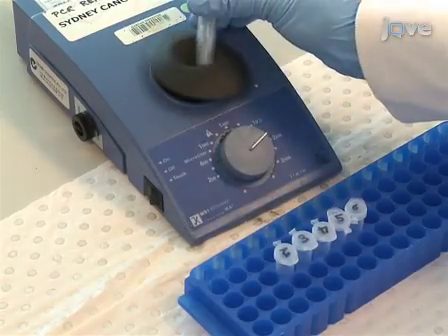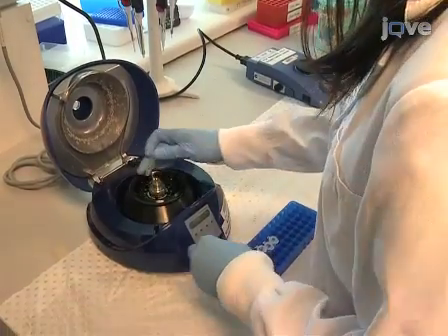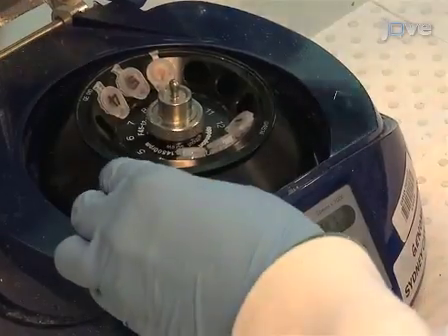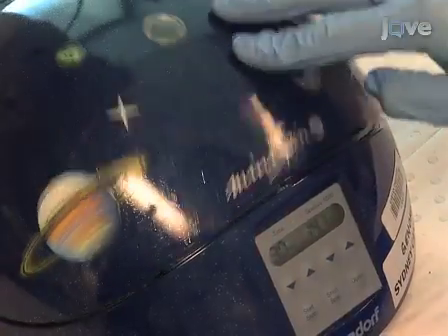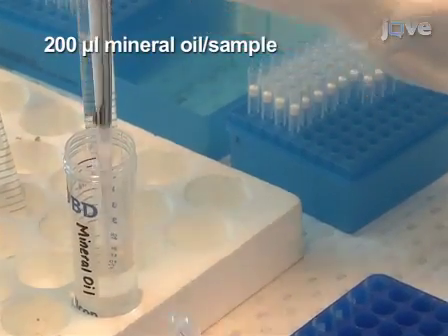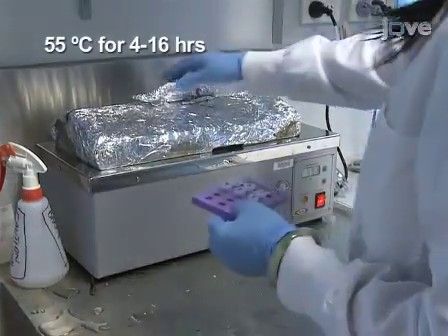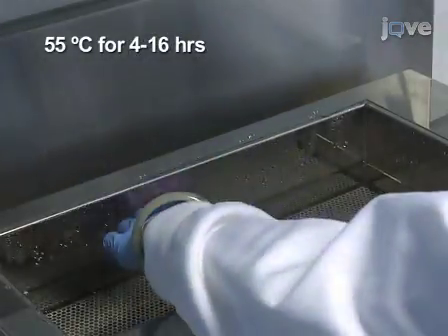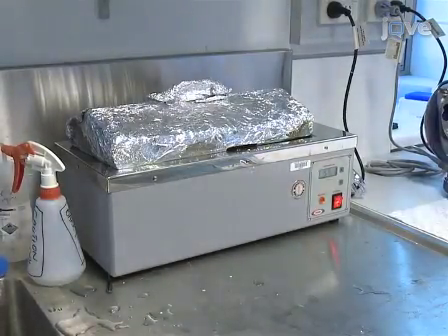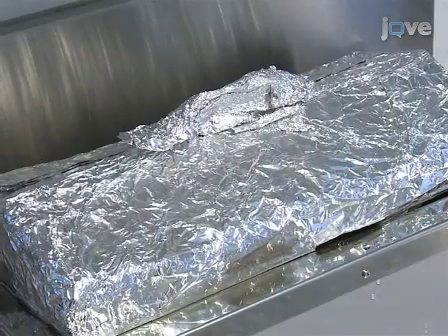Vortex the tubes and centrifuge for 10 seconds to ensure all of the droplets are at the bottom of the tube. Overlay the samples with mineral oil. Incubate the samples at 55 degrees Celsius in a water bath for 4 to 16 hours depending on the quantity and quality of the DNA to be converted. It is important that the bisulphite conversion takes place in the dark to avoid oxidation.